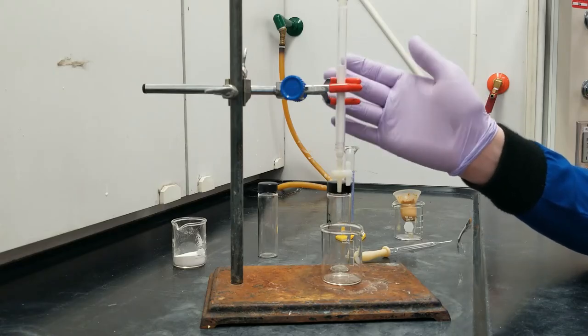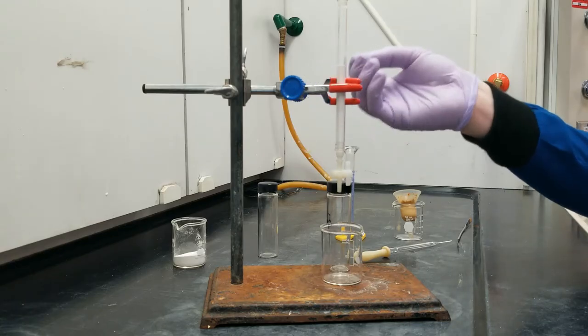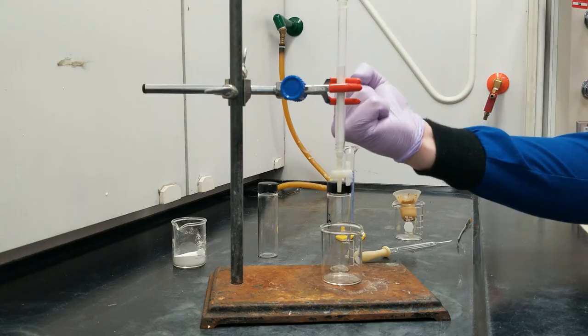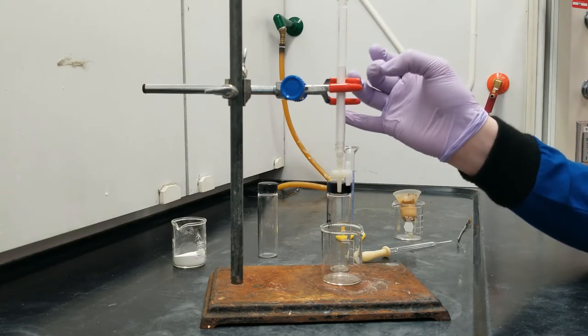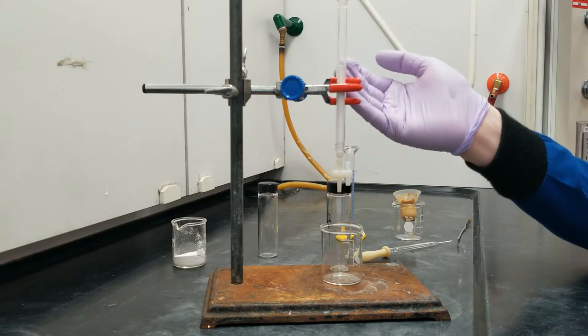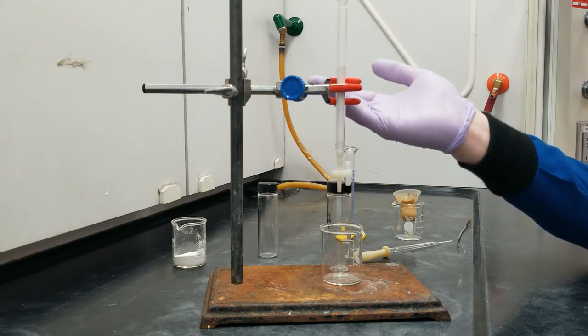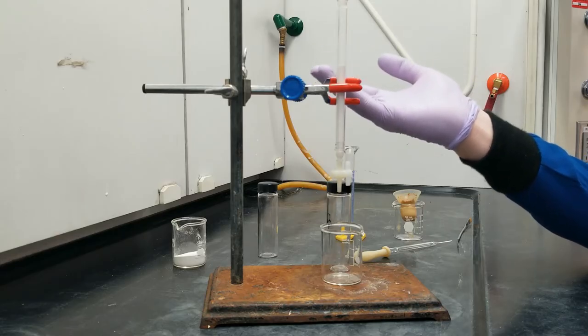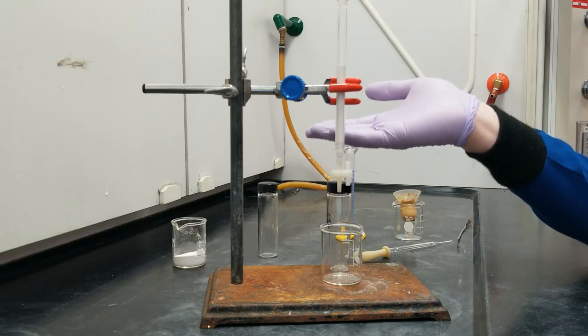Attracted to the very polar alumina. And so there's going to be a resistive force which is keeping them up, and we end up having to drag them down with a slightly polar solvent. As opposed to a really non-polar molecule in this environment, it's not going to be attracted to the alumina very much at all. And so very, very little force or a very non-polar solvent can actually drive a really non-polar molecule out of this system.